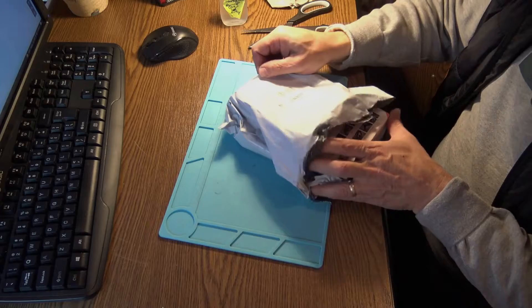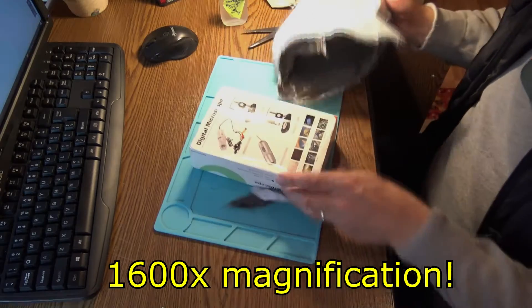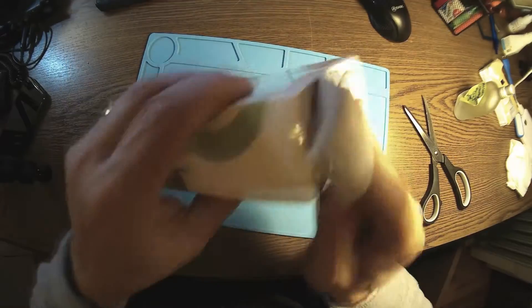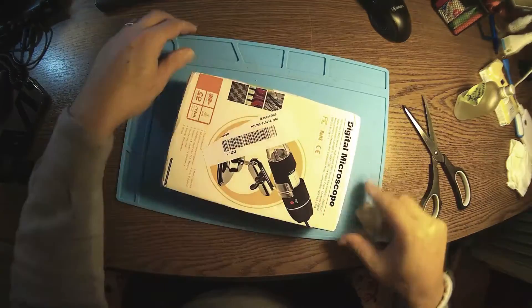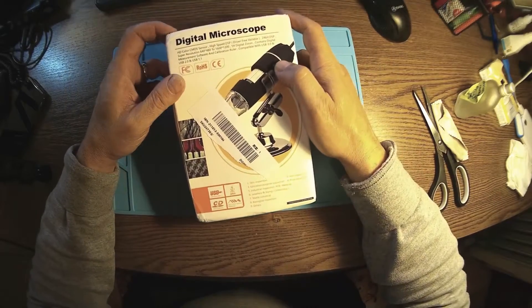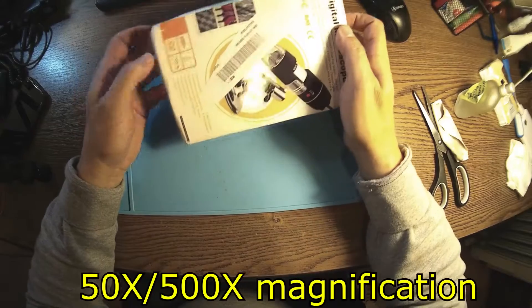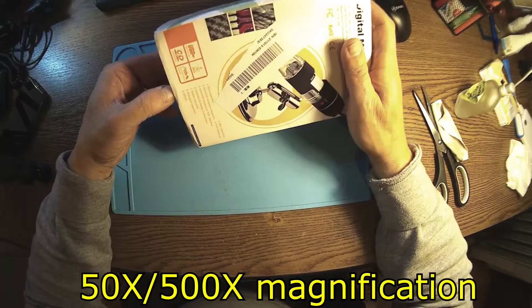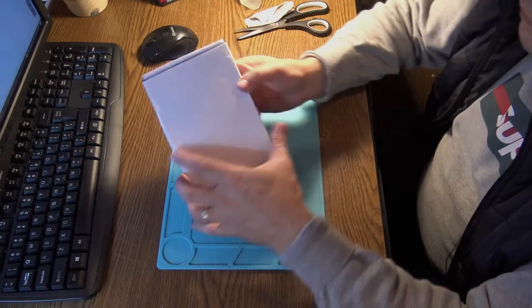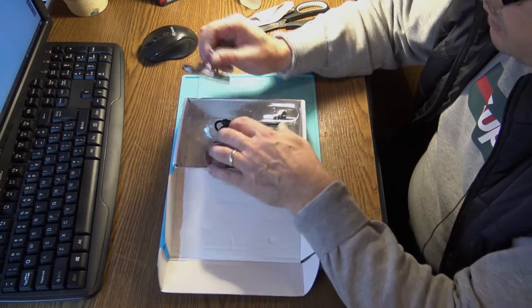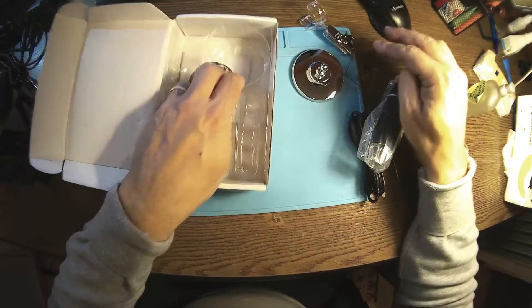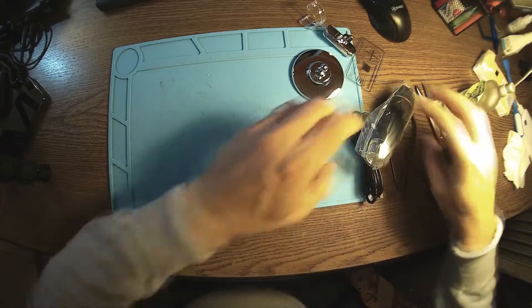If you remember, I had one before with 1600 times magnification. I was not happy about the way it was working - too much magnification, not enough space to work under the microscope. This time I bought one with 50 to 500 times magnification. It's very similar to the old one, same story, same really bad support.